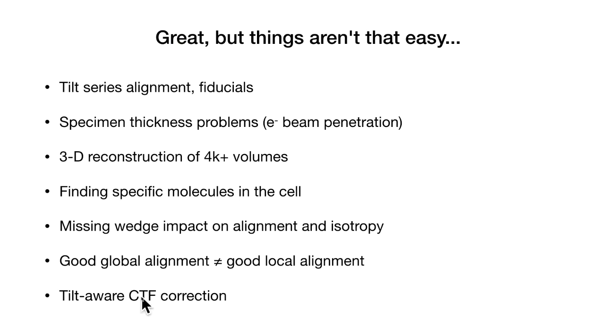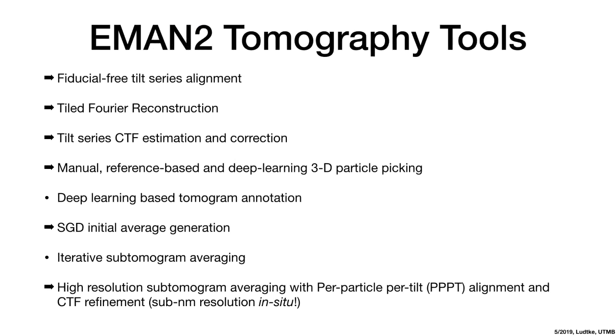And then finally, the same sort of problem that you have with single particle analysis, you have to do contrast transfer function correction. But in this case, we have tilted grids in the microscope, so the defocus is varying as you move across the image, and there are all sorts of issues you have to deal with that. So we have implemented this entire pipeline now in EMAN2.